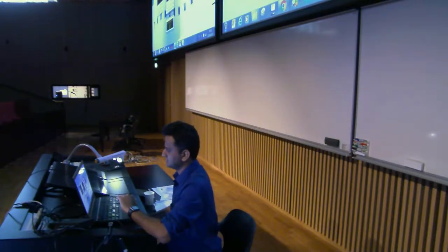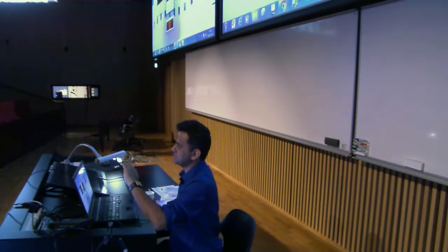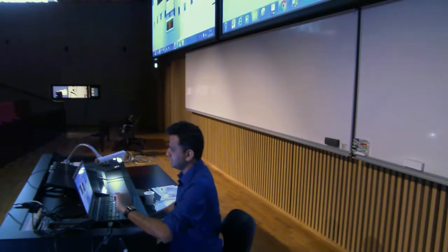Okay, this is how you can see for different time points also for the different Z. Always remember in ImageJ, everything you do is in one stack, meaning that what I'm going to look at here is for channel number 1, I mean, it doesn't matter here, but it is at this Z slice for this time point. Okay, there's also the possibility of doing this. This is just the visualization.